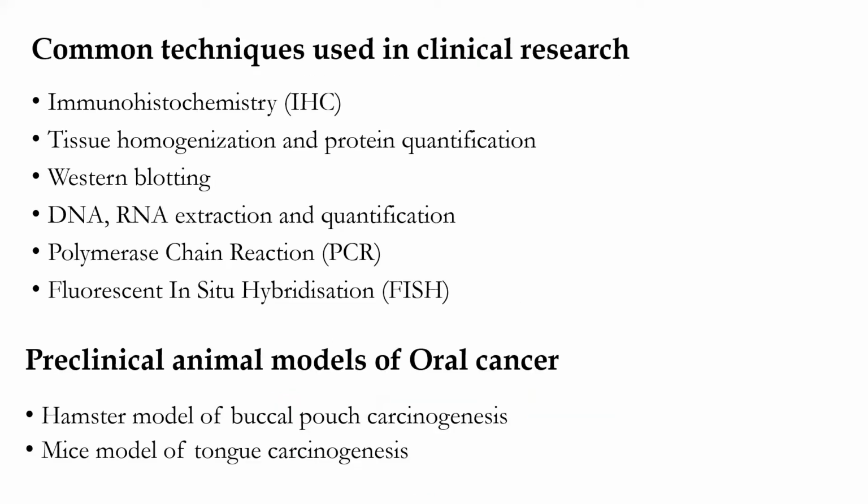So, the common molecular techniques used in clinical research, and which I have personally used, are immunohistochemistry, tissue homogenization and protein quantification, Western blotting, DNA RNA extraction and quantification, polymerase chain reaction, and fluorescent in situ hybridization. In today's presentation, we will cover mainly immunohistochemistry, tissue homogenization and protein quantification, Western blotting, DNA RNA extraction and quantification, and polymerase chain reaction.